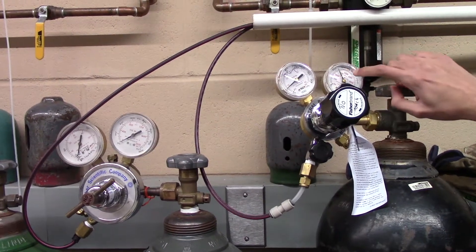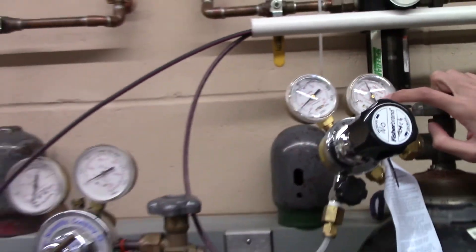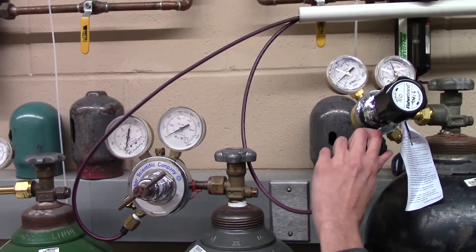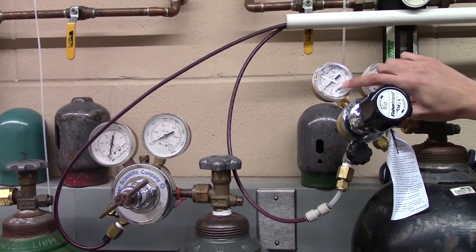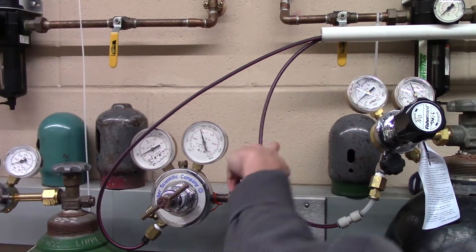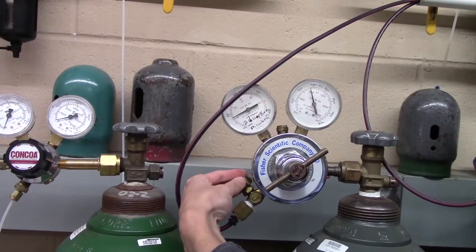Begin by opening the nitrogen gas tank's valve followed by the outlet valve, which is a small black knob, making sure that there are readings on the regulator dial indicating gas is flowing out of the tank. Follow these same steps to open the carbon dioxide tank.